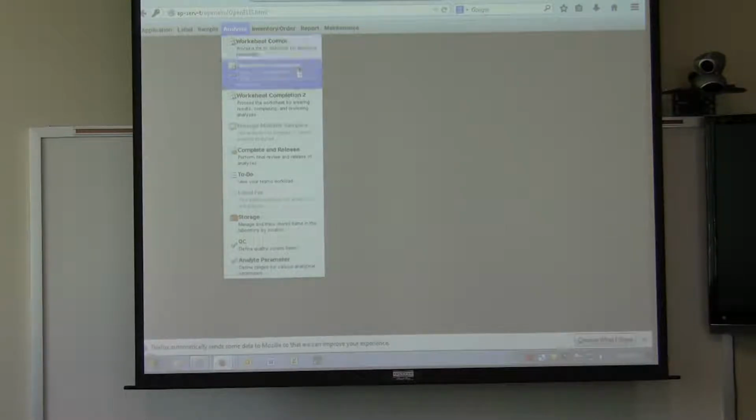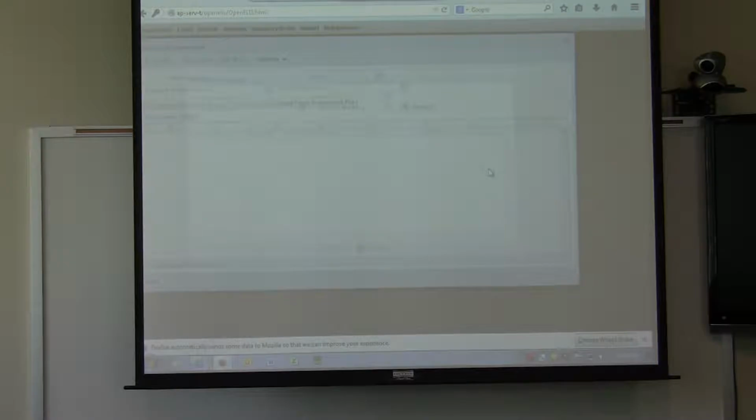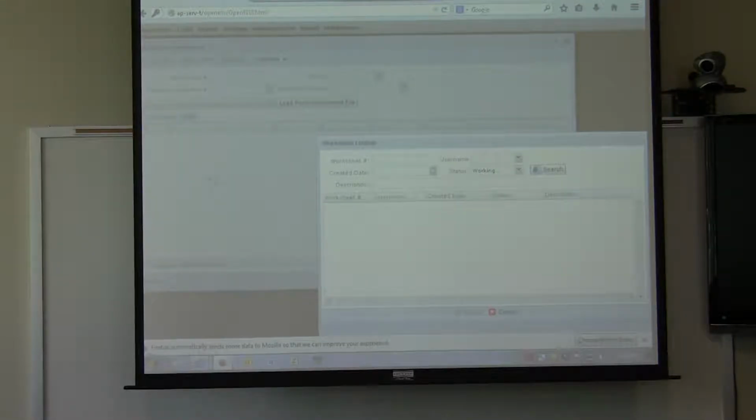So, you guys are familiar with the current worksheet completion version here. So just kind of pop this up. You get a little query screen to look up your worksheets, and you go do your thing. We're going to change that a little bit for you. So let me start off.